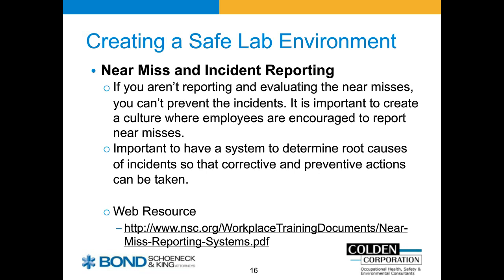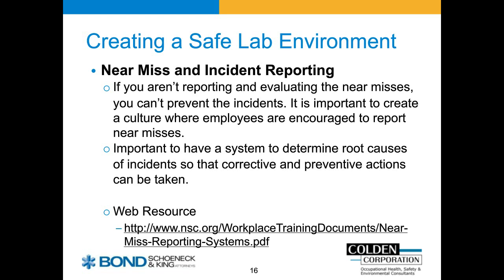The investigation and resolution of near misses is one of our best leading indicators of health and safety performance. We're always looking for those leading indicators in our health and safety management systems. I get it, there's serious challenges in higher ed to making this happen. Operations are very diffuse. You may have 2 or 3 people in a lab in a corner of a campus no one gets to. But the workforces are constantly in flux. Every 12 months you may have different people in and out of a lab. There are off-campus activities going on and training opportunities for students EHS people might not even know about.